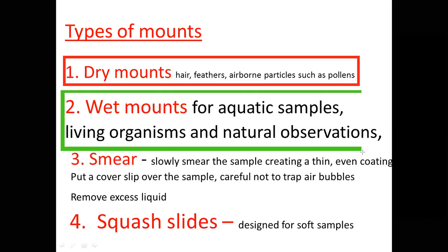So you're supposed to take wet mounts very cautiously, because they are moving. Some of the living organisms are dying because they are living. A living organism can die in a matter of minutes. So you may get a negative result because of how prompt you are to make it and also to observe.